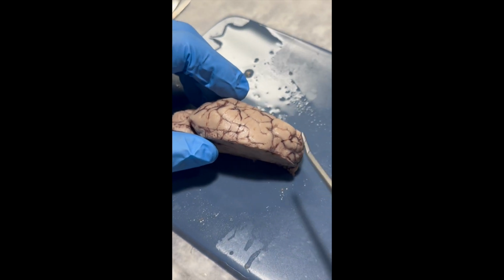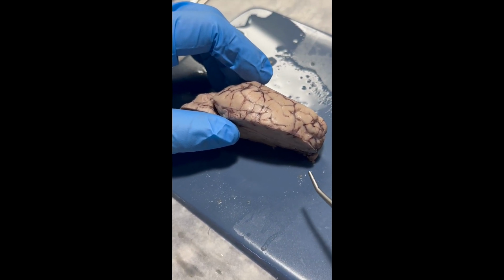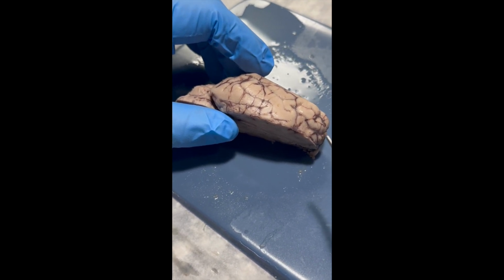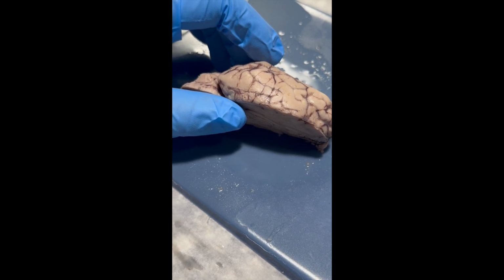It also surrounds the blood vessels as they enter the brain, or the capillaries as they enter the brain. As well as this, astrocytes hug the capillaries and secrete chemicals that create tight junction gaps in the capillary endothelium cells. This produces the blood-brain barrier.